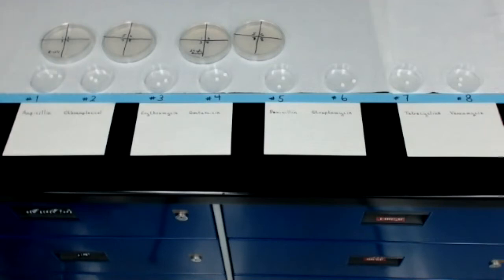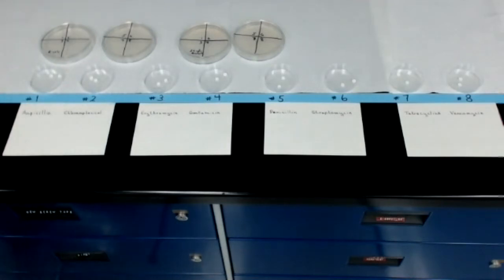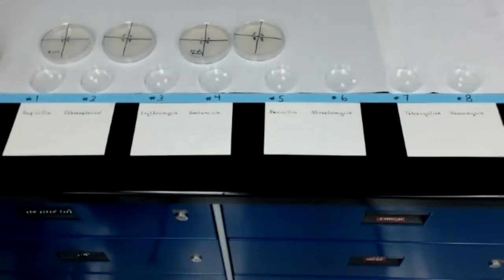But I'm going to go ahead and read off the names of the antibiotics because I've listed them on the cards underneath the numbers, and I have found that sometimes the numbers that are on the tape here don't show up very well on video. So number 1 is on the far left, and those 2 discs are ampicillin discs. Number 2 dish has chloramphenicol discs.